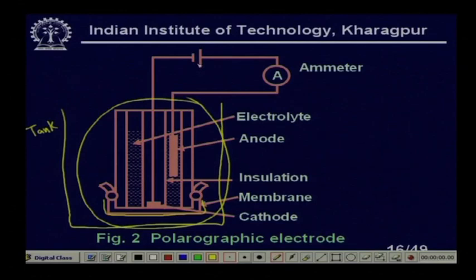We have seen that if we increase the bias, obviously the output will increase with the concentration, right. Now, for a fixed bias, for increased concentrations I will get higher relative current outputs, which will be utilized for the measurements or for the control of the dissolved oxygen partial pressures in the liquid, clear.